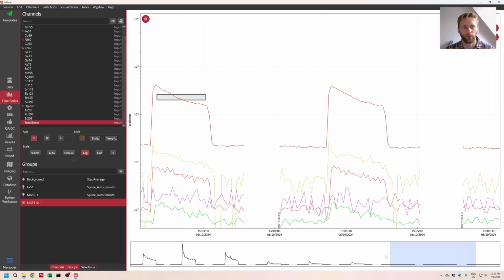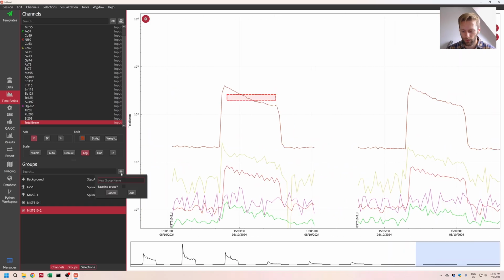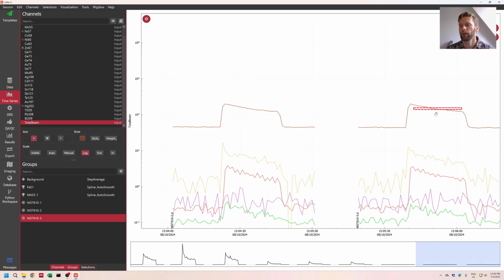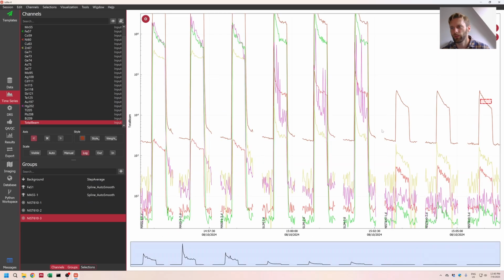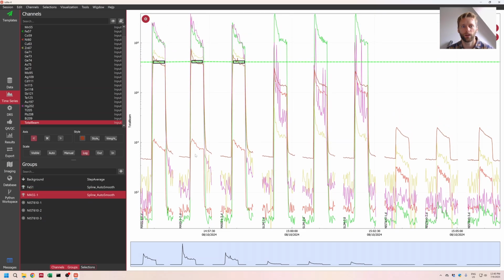Okay, let's do this, and then we'll create another sample, like this. I'll highlight this part, and last but not least, here we can say FES1, Mass 1, and this is 610, 1, 2, and 3.